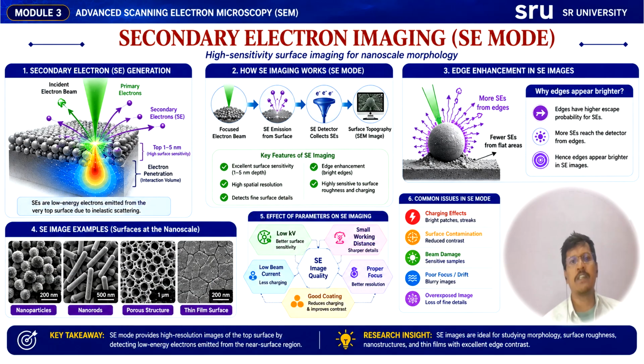We also discussed the secondary electron imaging mode. Here we discussed the importance of the secondary electrons in image processing technique. So now we are going to discuss the continuation to the scanning electron microscopy, that is the backscattered electrons and the sample preparation.